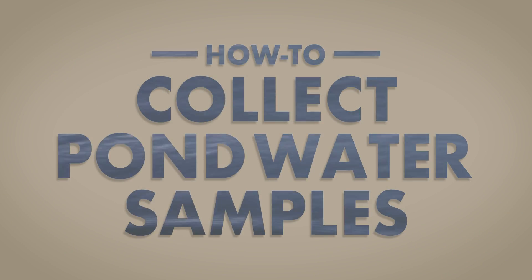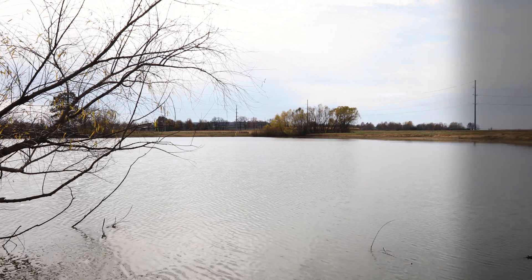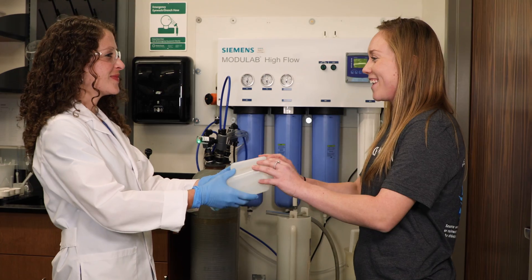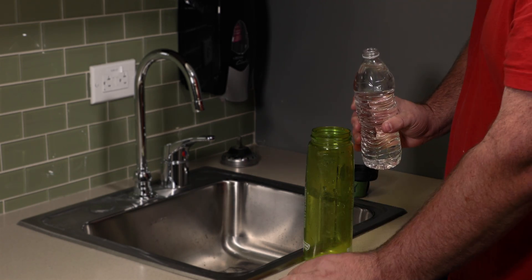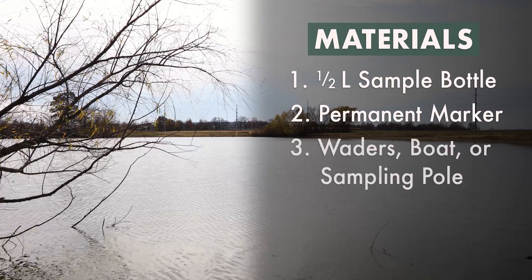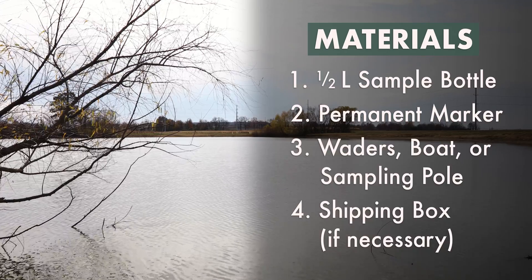To obtain the best possible results, follow these steps to collect your pond water sample. You will need a clean 1.5 liter sample bottle, obtainable from your local county extension office or from the AWRC Water Quality Lab. You can also use a regular plastic water bottle — just pour out the water first and don't drink from the bottle. You will also need a permanent marker, waders, a boat or sampling pole, and a shipping box if necessary, which is available from your county extension office.